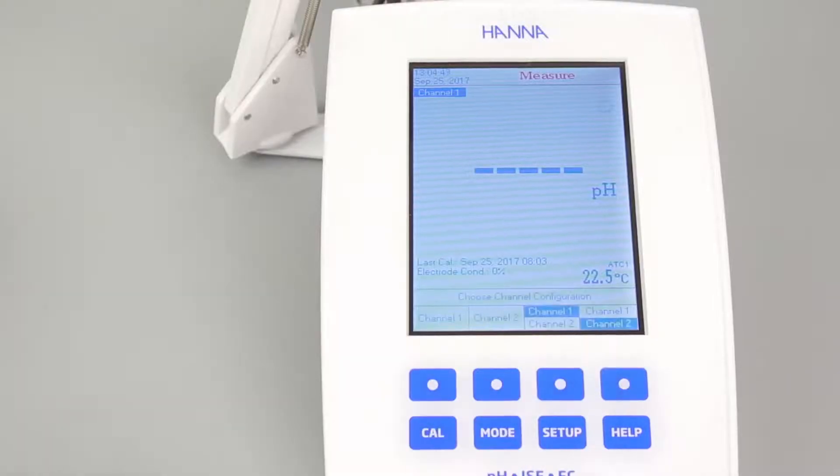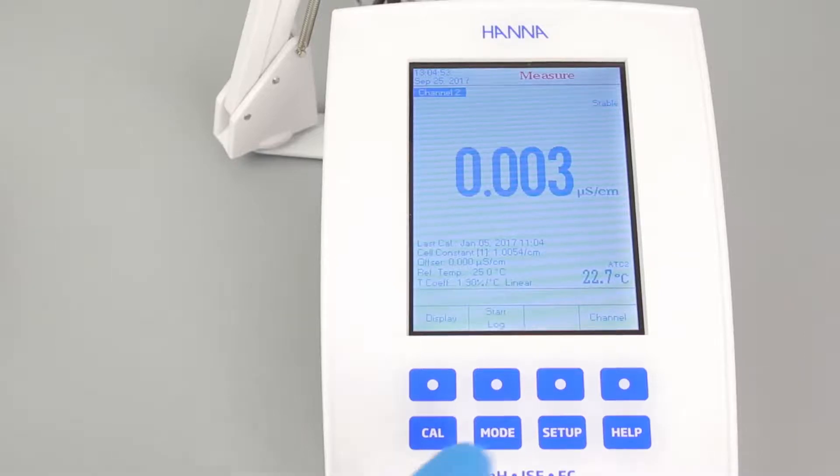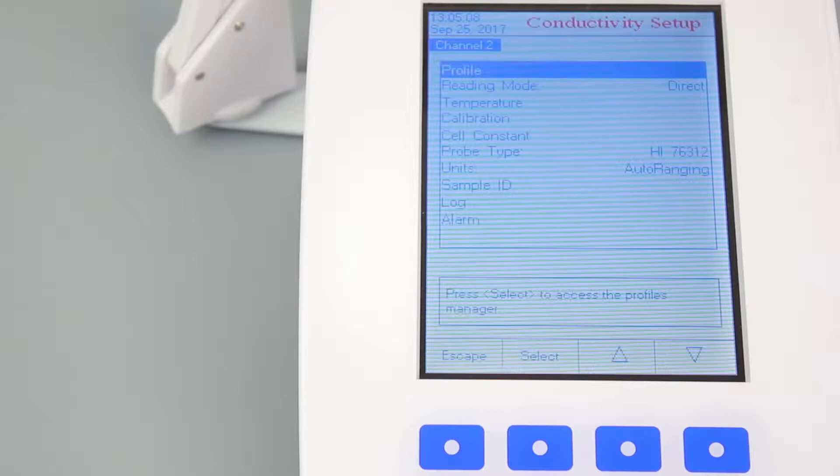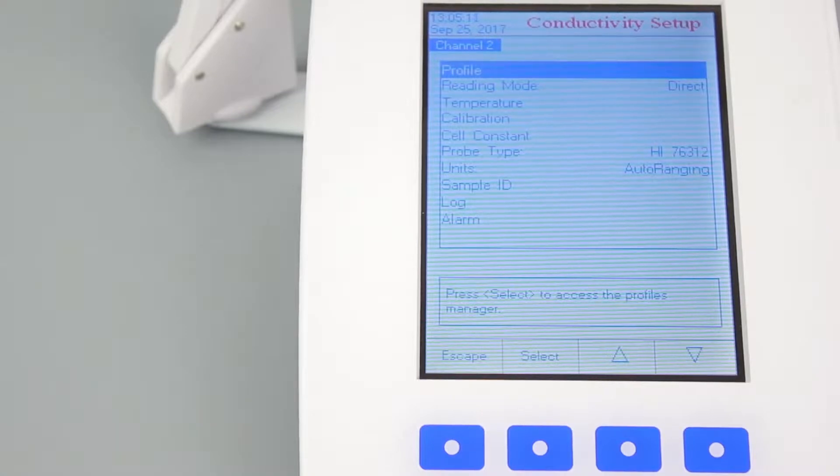You can also view the conductivity setup by selecting the appropriate channel and going into the setup. You will find everything you need to customize your measurements here. With all the options to choose from, I really recommend going through each setting to determine what will be best for you.